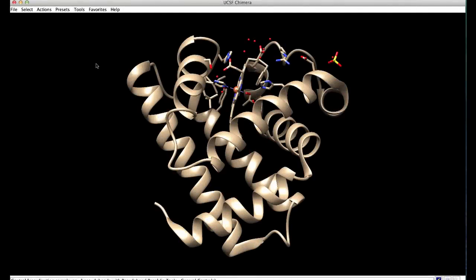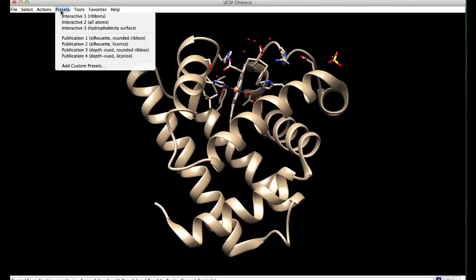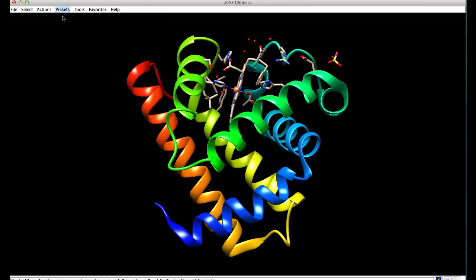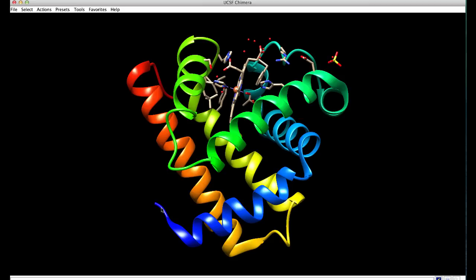Once you have found a view that interests you, you can check the preset views. For example, the first interactive view colors the protein ribbons according to the rainbow color scheme, starting with a blue N-terminus and ending at a red C-terminus.